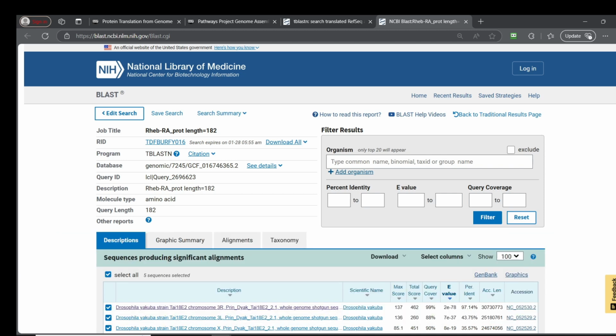So, when performing a BLAST search, we may actually return a number of matches, often referred to as hits. For regions of local similarities between our query sequences and databases, however, each hit is not necessarily statistically significant.